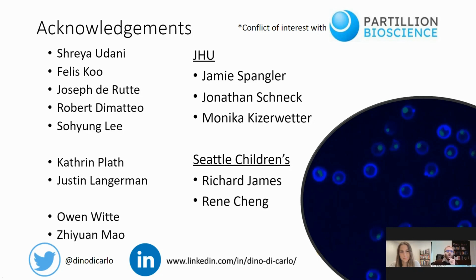The other thing that requires some calibration for some of the flow sorters is something called drop delay, because nanovials are slightly bigger than most cells, and the drop delay setting is not optimized for nanovials. We find that for smaller nanovials and systems like the Sony system, we don't need any drop delay calibration. But as we go to larger nanovials, then we do some calibration to make sure that the drop delay is calibrated to maximize the sort yield.